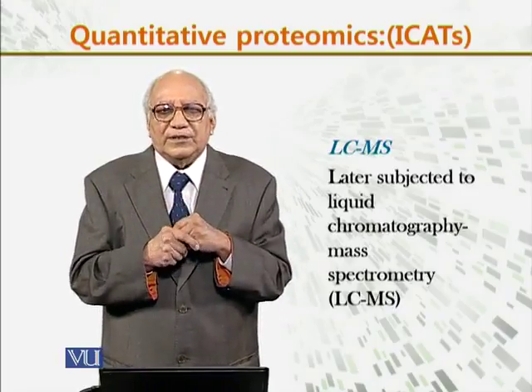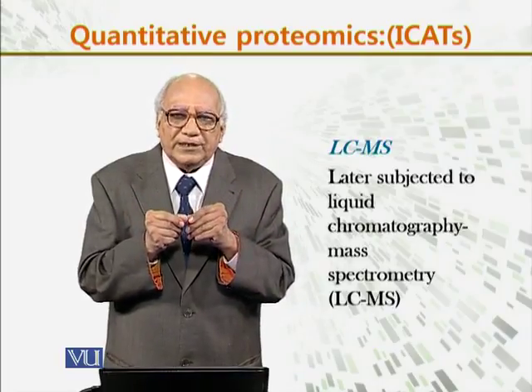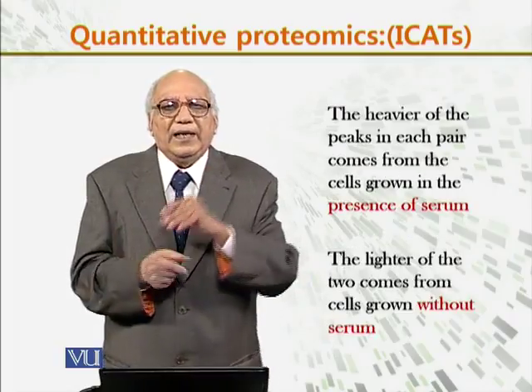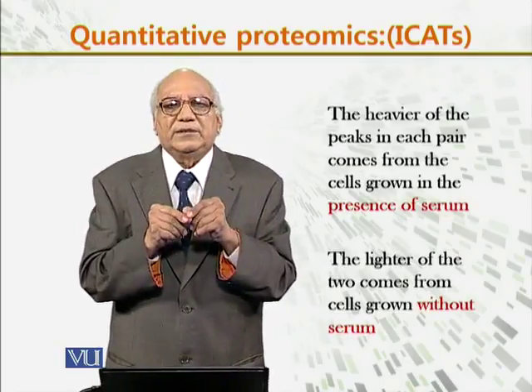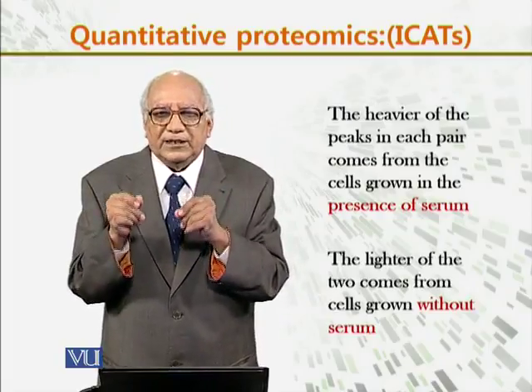And then what happened? The heavier of the two peaks in each pair comes from the cells grown in the presence of serum.